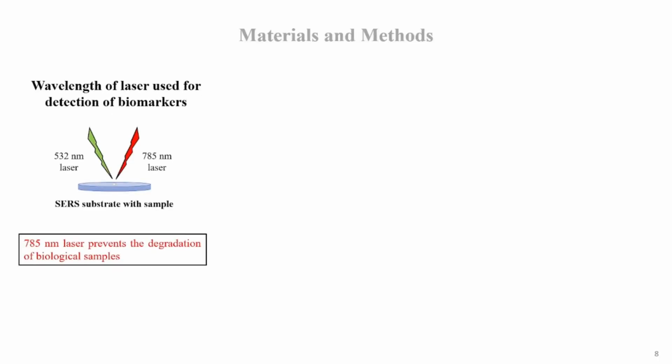Now, the second part of the materials and methods was to use two different wavelengths of light because I'm trying to standardize my technique.